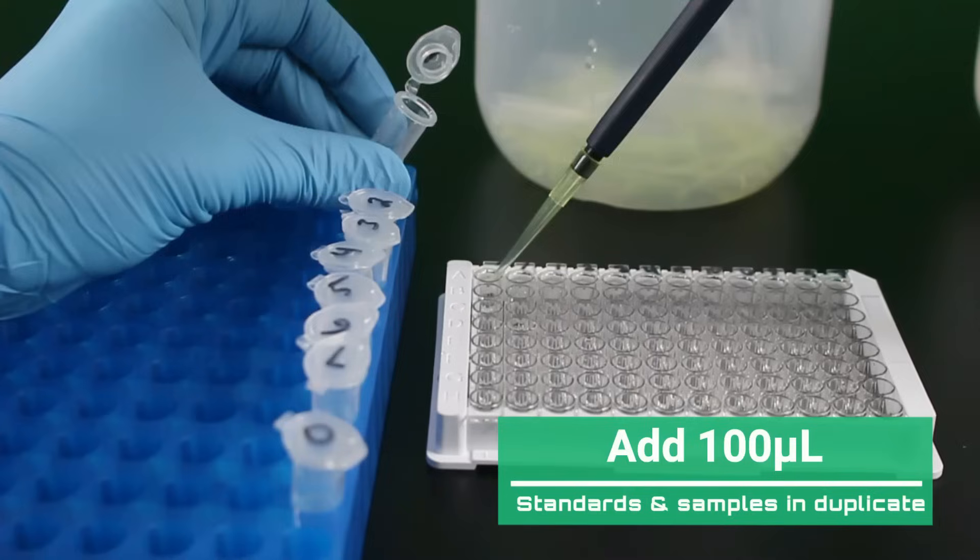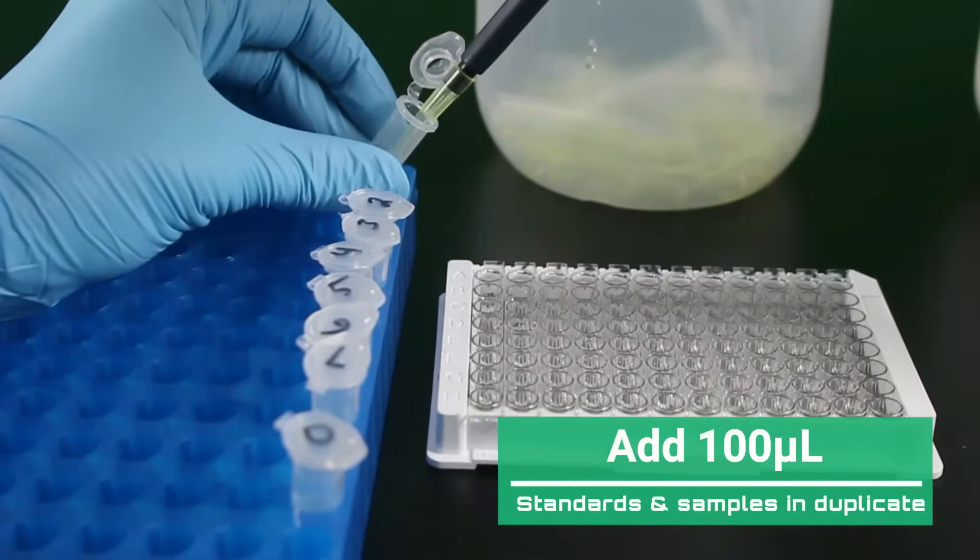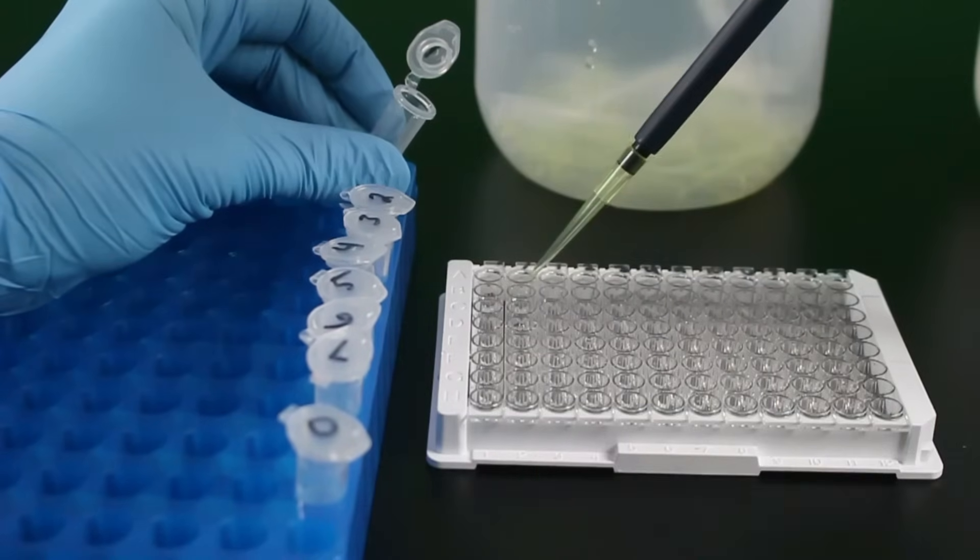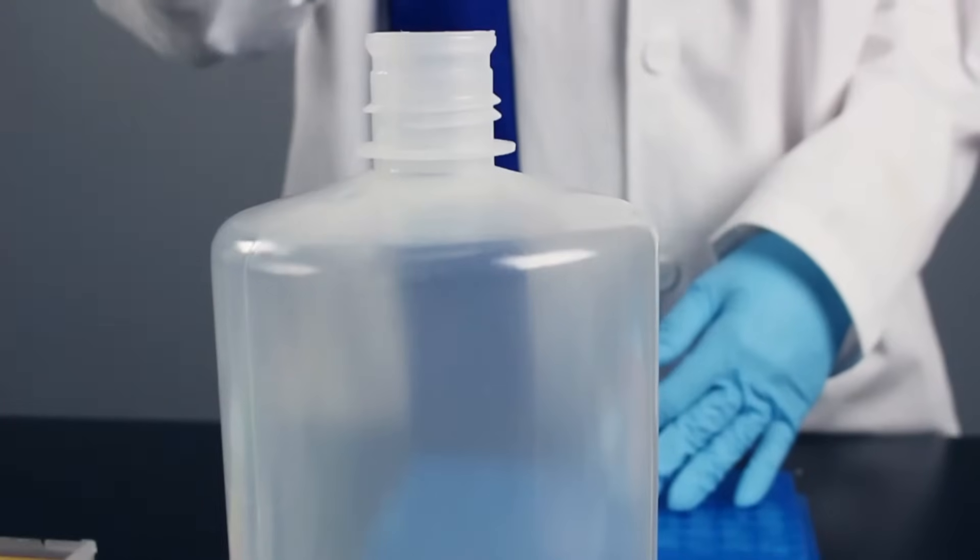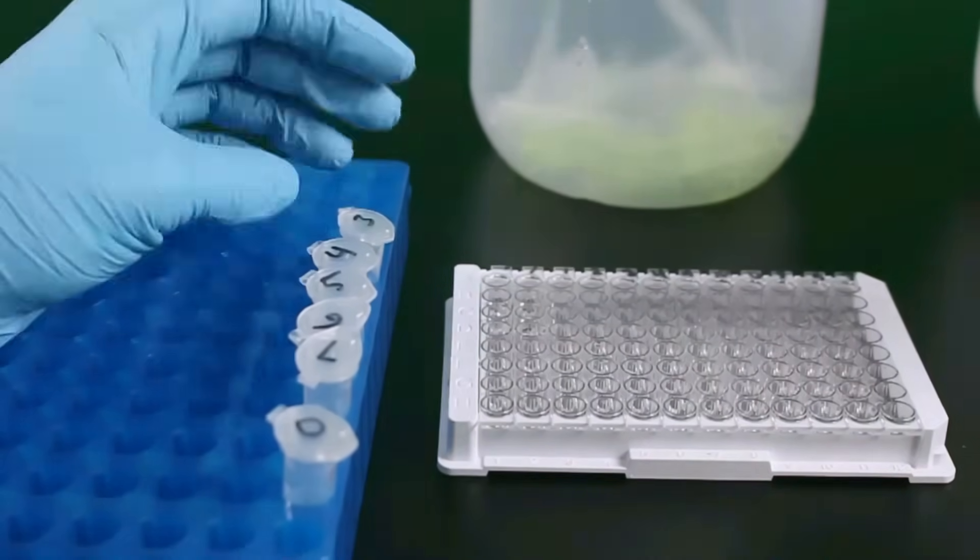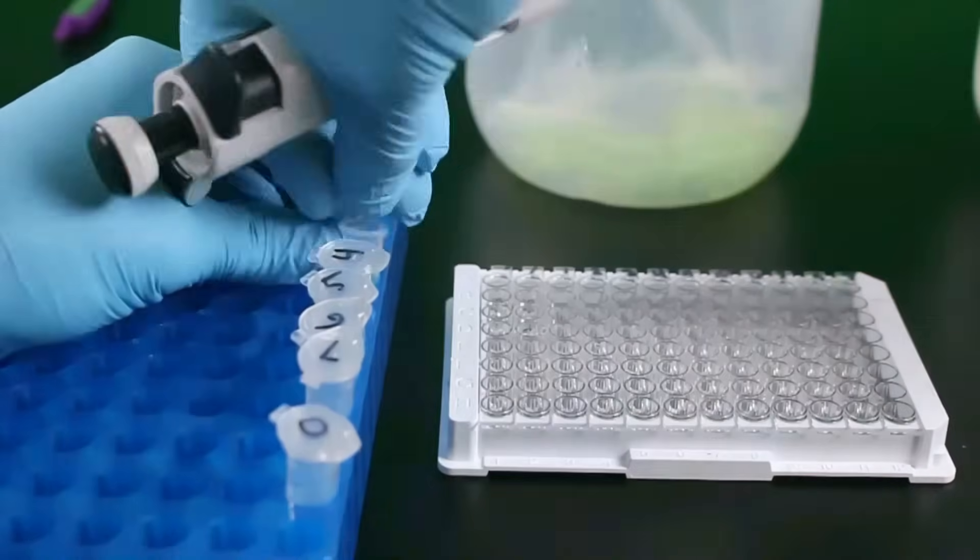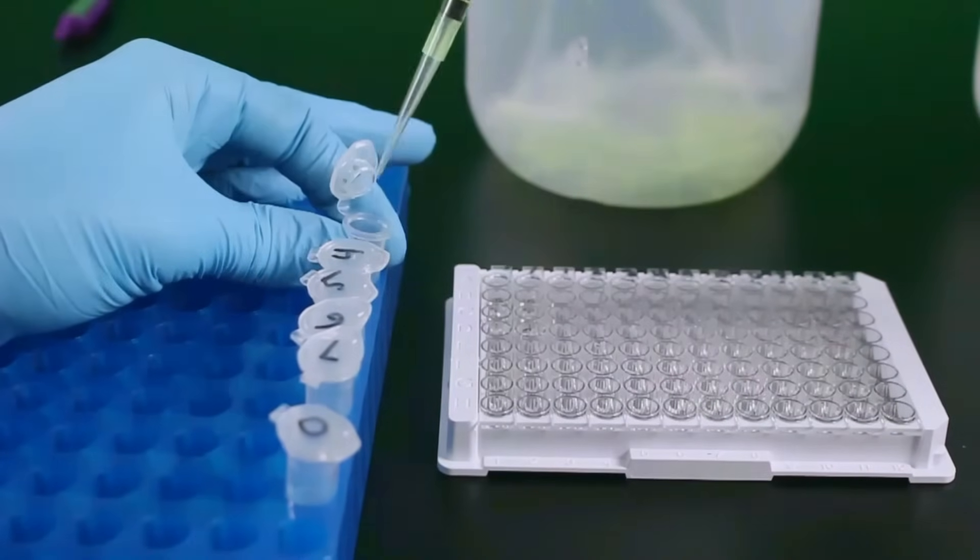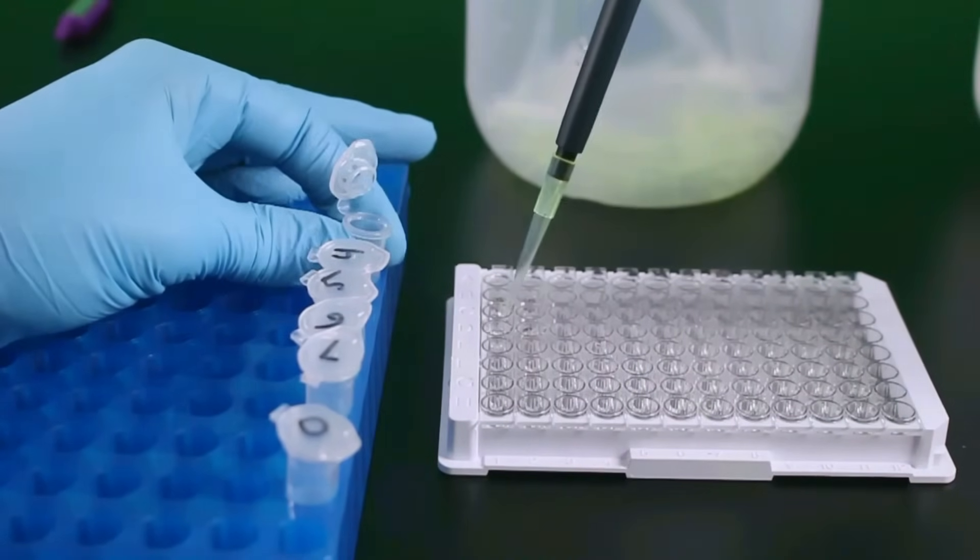Add 100 microliters of standard and sample in duplicate to each well according to a plate map. Get a new pipette tip between each standard. Once you've added your standard, you can add your diluted samples. Keep track of the plate map for every run. Ensure there are no bubbles as the capture antibody should be able to interact with the homogeneous mixture.